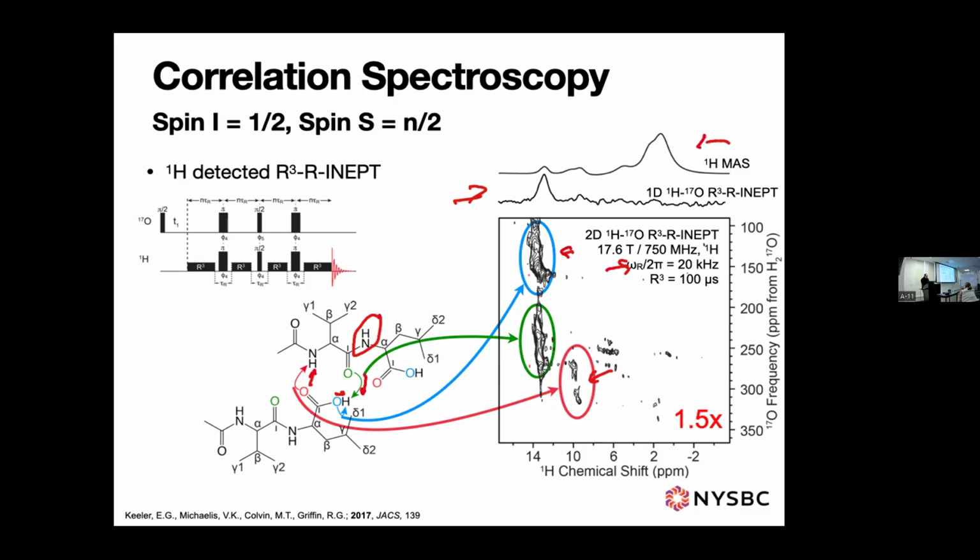And they do, and it looks pretty close, although there's something funny in the line shape. Well, that's because of the broad quadrupolar line shape and issues with that. It's part of why the line shape is funky. As far as the amide protons, it's mainly these two protons, right? Yes. That's cool.